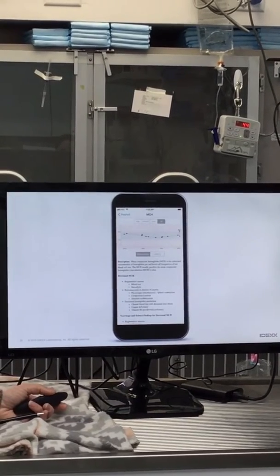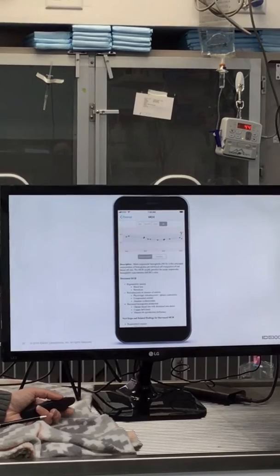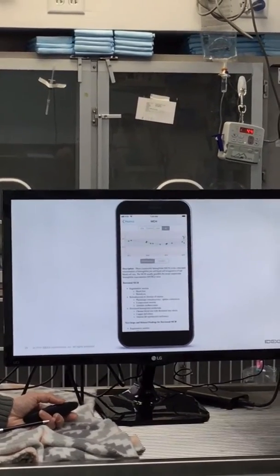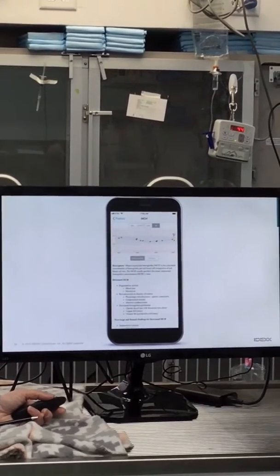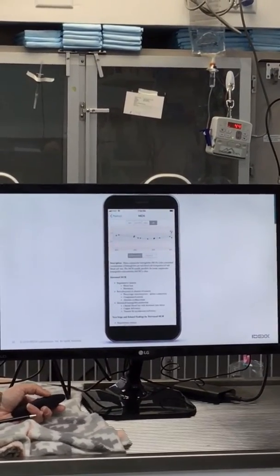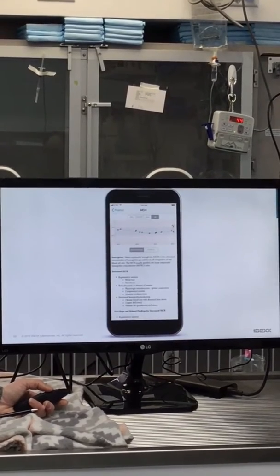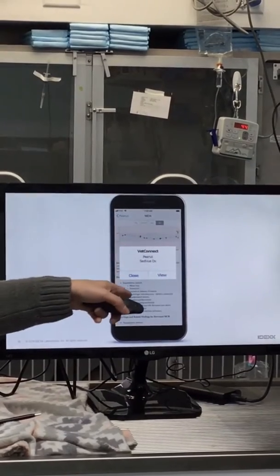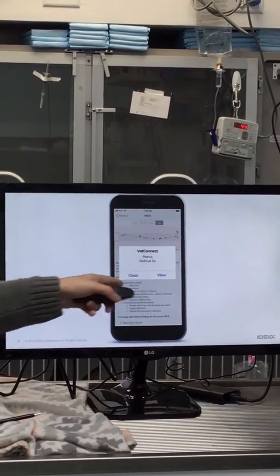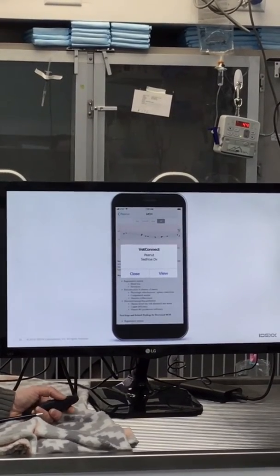Now, I highly recommend that you turn off notifications because you are 24 hours. So let's say you're off and you're looking at that doctor's results. Your phone will ping, and whenever those results come across, it actually comes across faster to VetConnect Plus than it does to print. I mean, it's that fast. So if you did have the notifications turned on, it just tells you if you want to look at it or not. But it dings just like a text coming across.